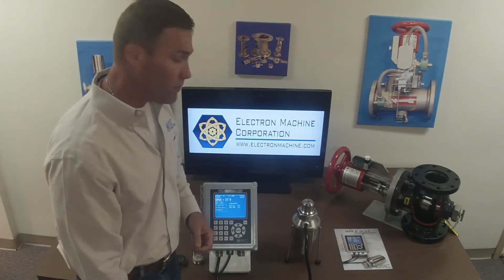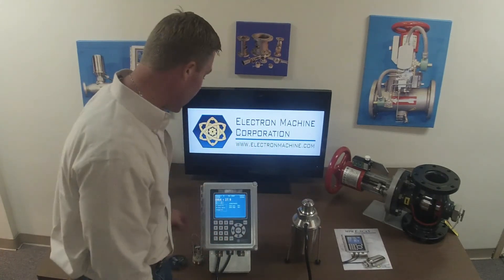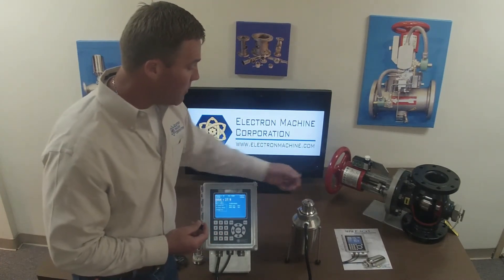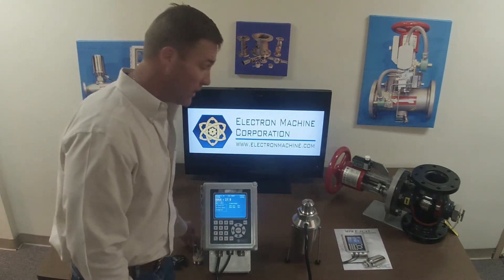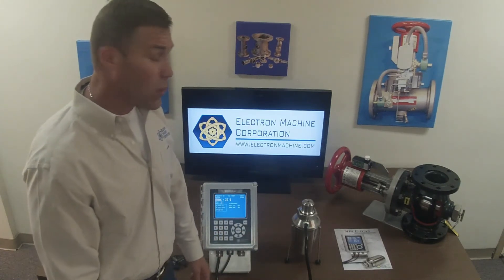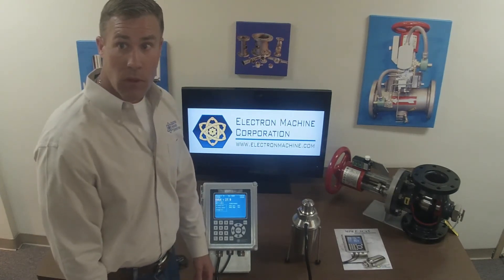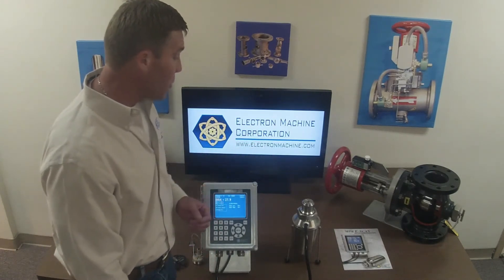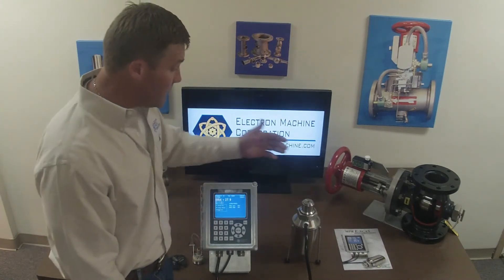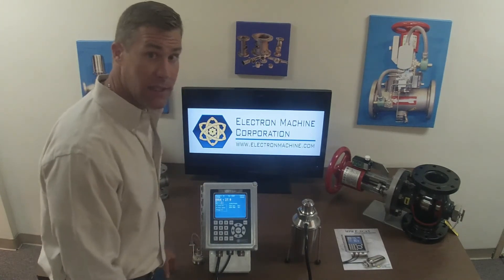The sensing head is NEMA 4 rated as well, all stainless steel. The sapphire prism is nearly as hard as diamond so you don't have to worry about scratching it. The prism holder is made out of 2205 duplex stainless steel, and can also be made from other alloys such as Alloy 20, Hastelloy C, or even tantalum for very aggressive hydrochloric acid applications. We also offer intrinsically safe and air purge options for hazardous environments, and we custom tailor the sensing head to your application for maximum CCD resolution.